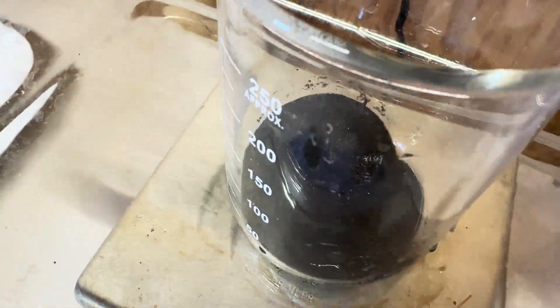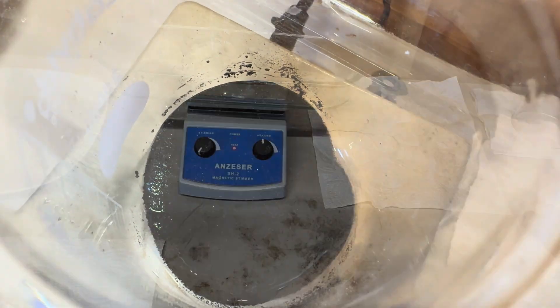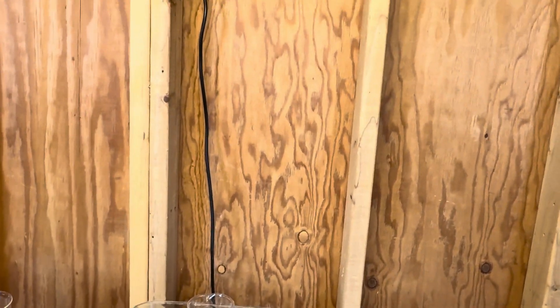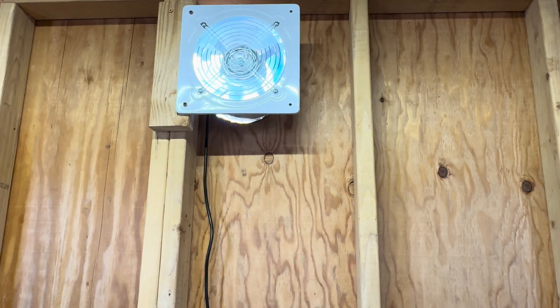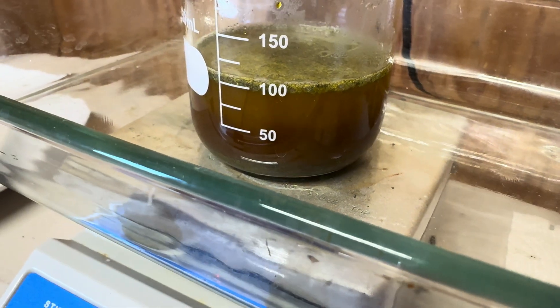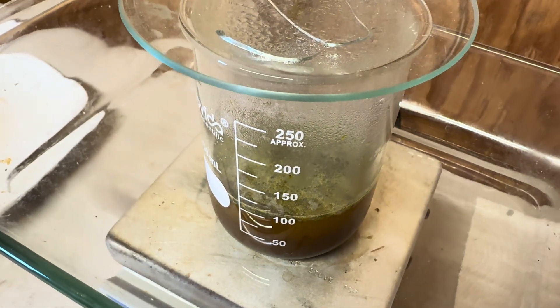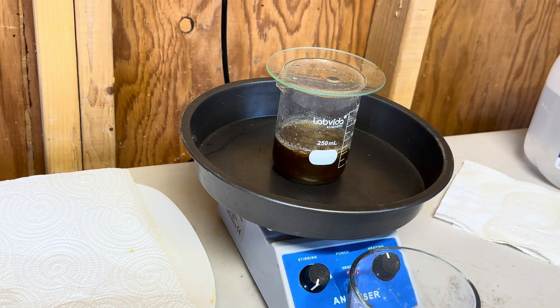Here is our black sand that we had cleaned out and we are going to add in some hydrochloric acid to remove the base metals. I've got my fan going to keep myself safe. I am wearing my respirator and my safety glasses, and you should too. I'm bringing the hydrochloric acid up to a boil and I'm going to let it boil for 45 minutes to get it clean, and then we will give it a good rinse.